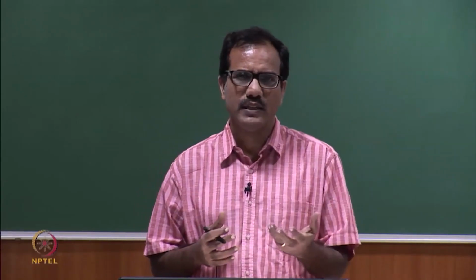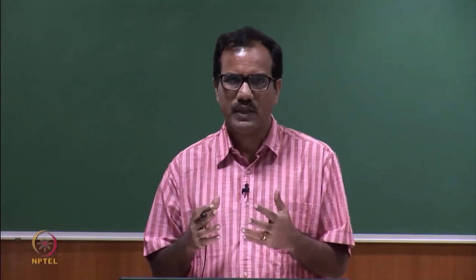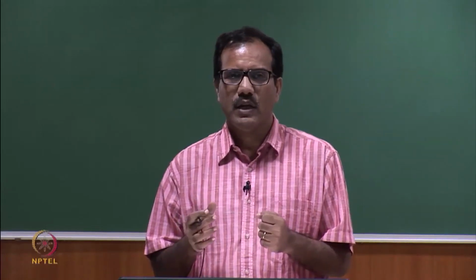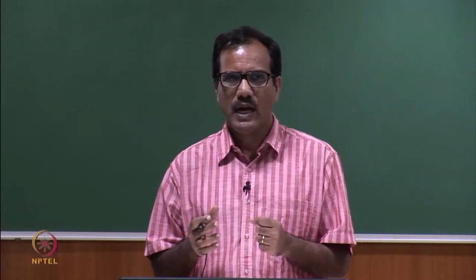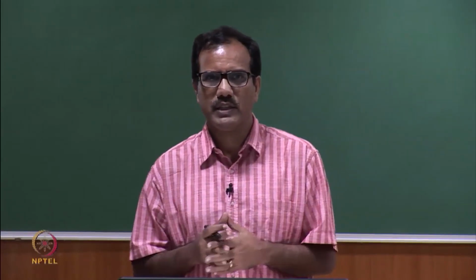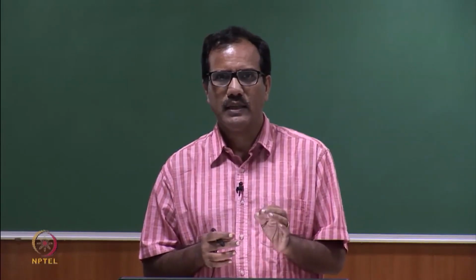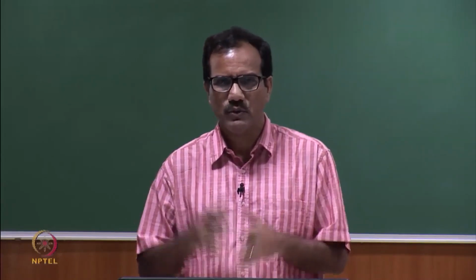So, why do we need the decay shape? Because if we analyze the decay shape, then we can resolve multi-exponential decay. If there is more than one fluorophore in the system, then your decay will be multi-exponential, and if we do not have the decay shape, we cannot resolve it. So, one must be able to temporally resolve the recorded signal at least to such an extent that the decay is represented by some tens of samples. So, you need some points.